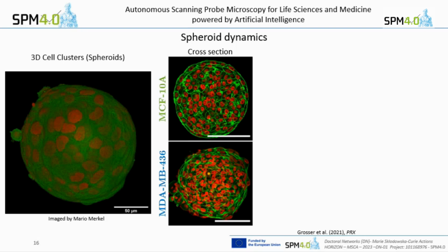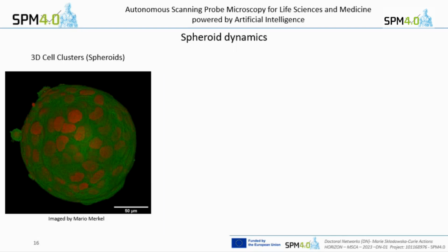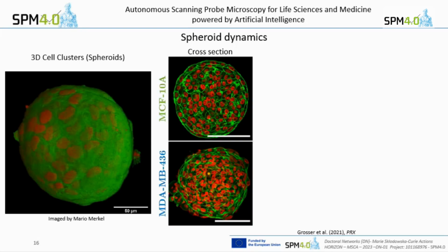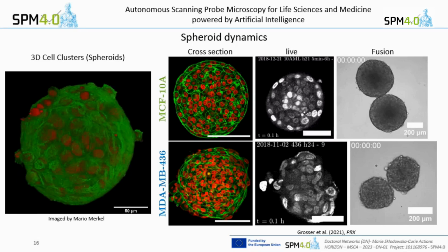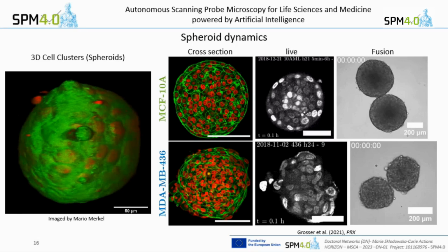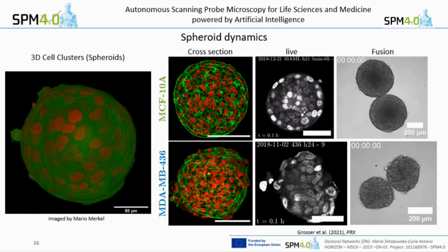This is basically what Steffen tried to show with these fusion experiments, because you can analyze them just like liquids, like the fusion of liquids with different properties or surface tension. You can see that you have a higher surface tension here than you have here. It's one way to describe it.